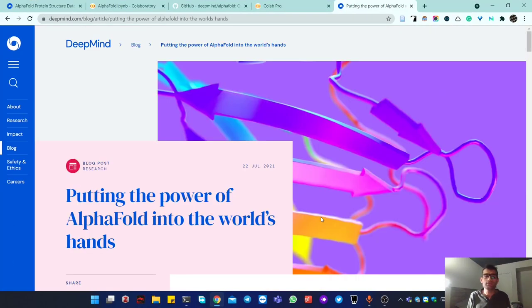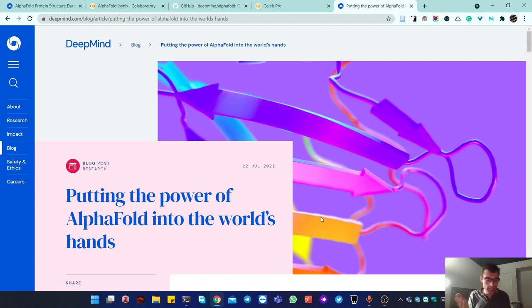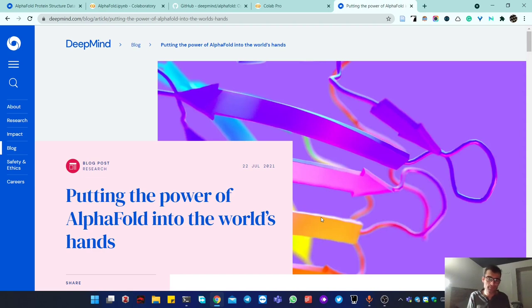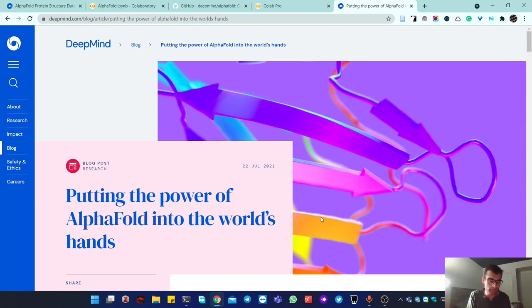Most of the news about AlphaFold and how to use it is directed toward people with a lot of bioinformatics knowledge. But a lot of the important parts are also relevant for wet lab scientists who don't have deep bioinformatics knowledge but are excited to check their next protein — maybe they want to add a linker, make a fusion protein, or work with a protein from a less common organism.